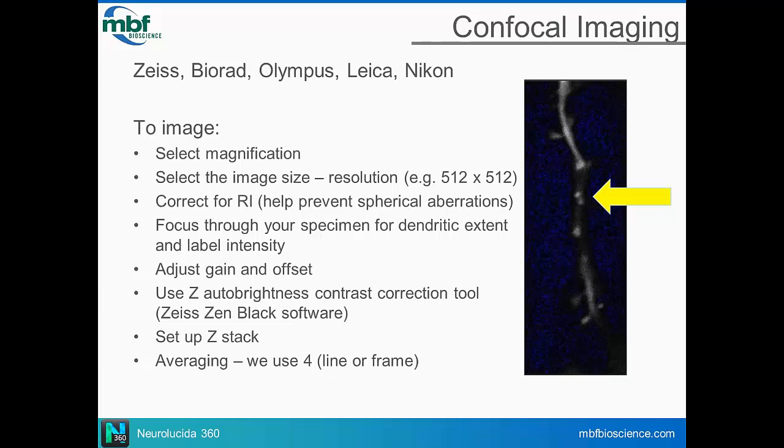And if you're taking away all of your background noise, you can actually be taking away a lot of signal, which could be the spine head. And so you can again alter and bias your data that way as well. So when people ask me what kind of picture to take, I say take an ugly picture. Don't take a picture that you want to have published. Right. I say that also for other applications like stereology.